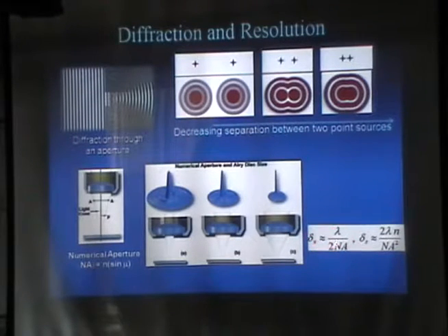So it's not good. The other option is to use higher numerical aperture, so you buy bigger objective lenses, but there's a limit. Ultimately, this at most can be 1, and that's it. So what can you do? Well, that's where we can come up with a new method.